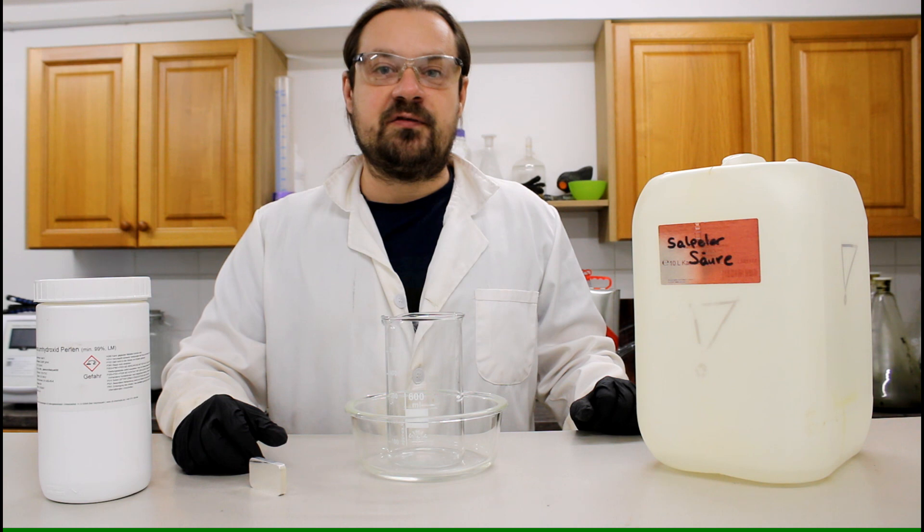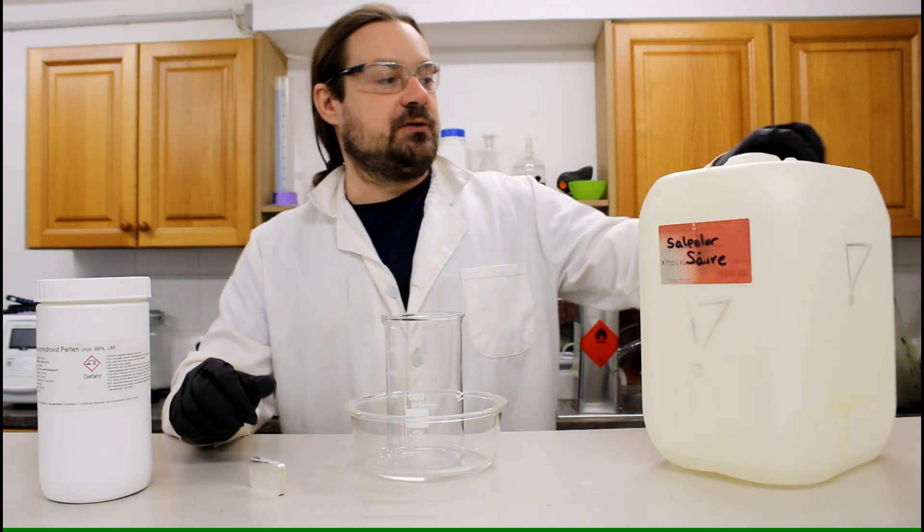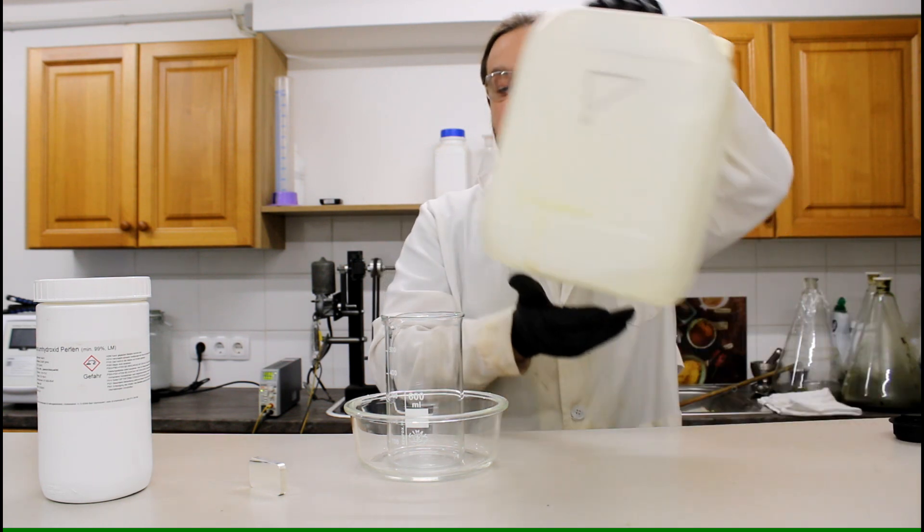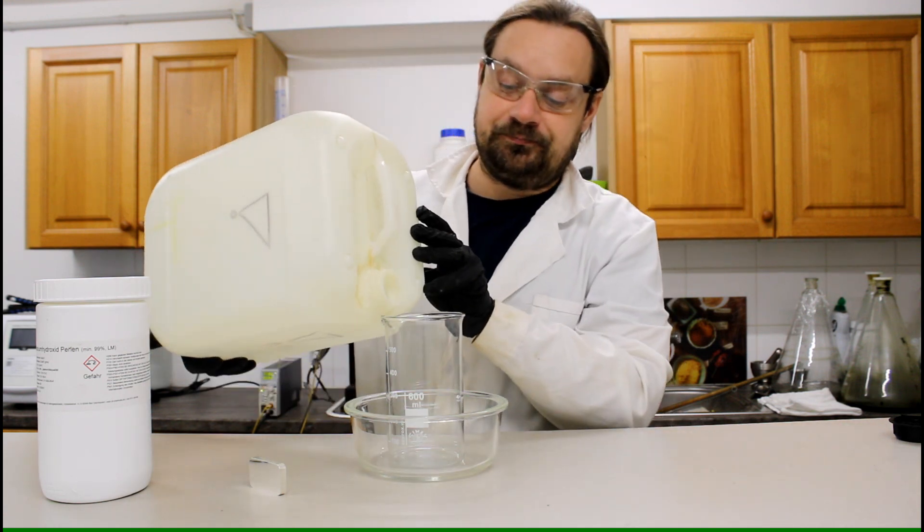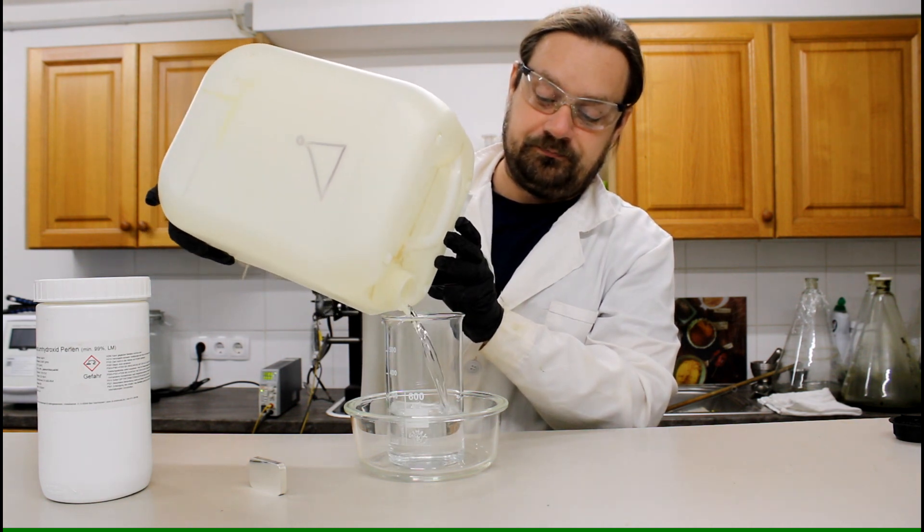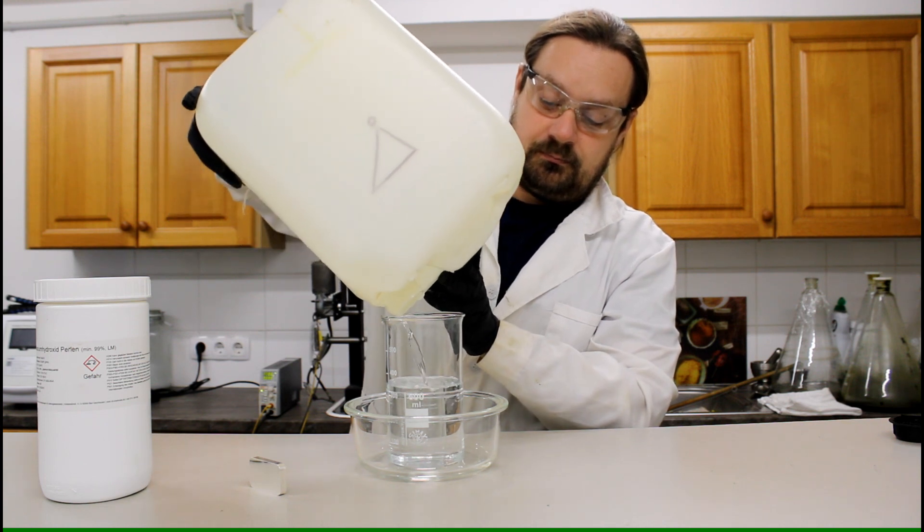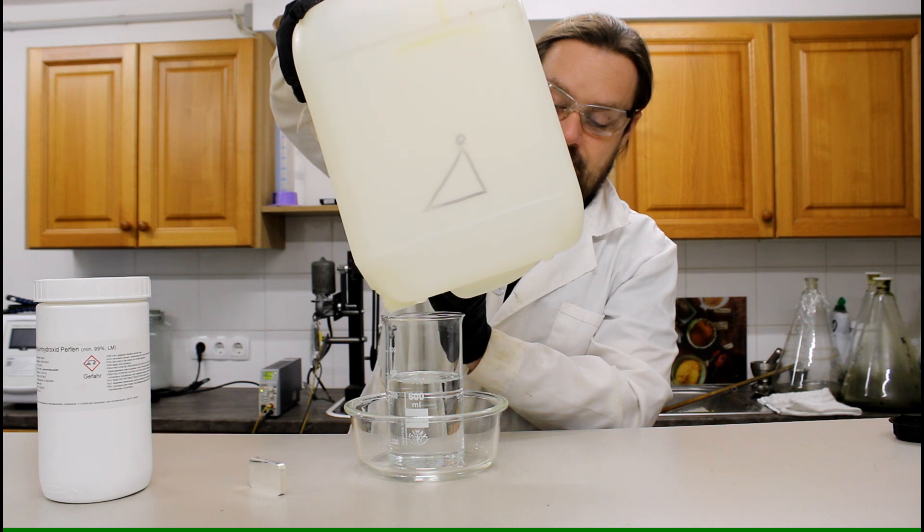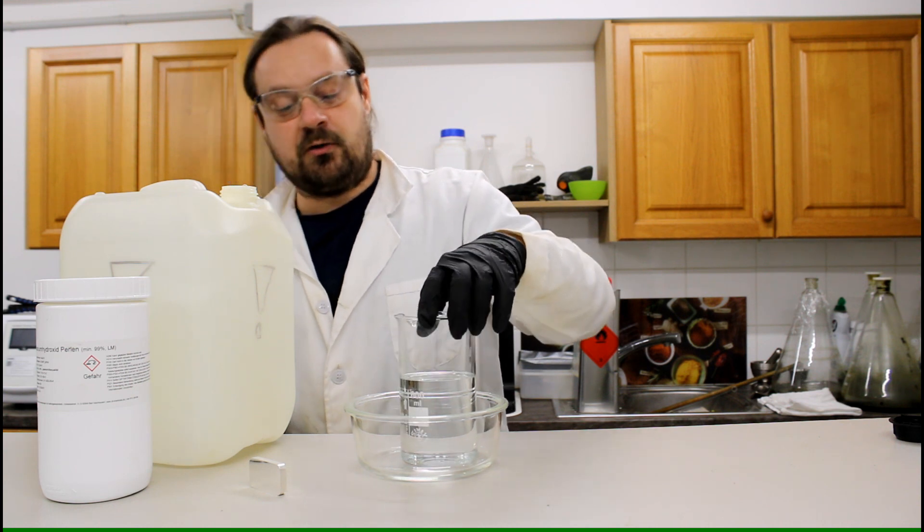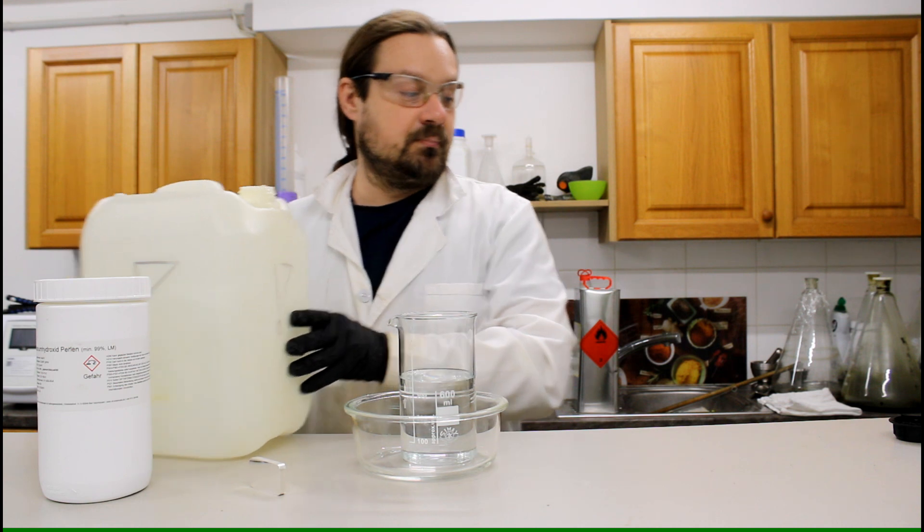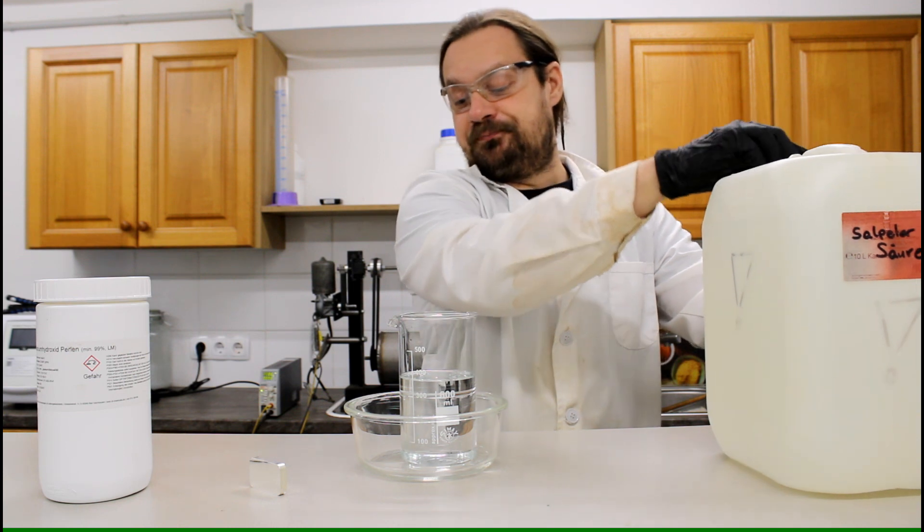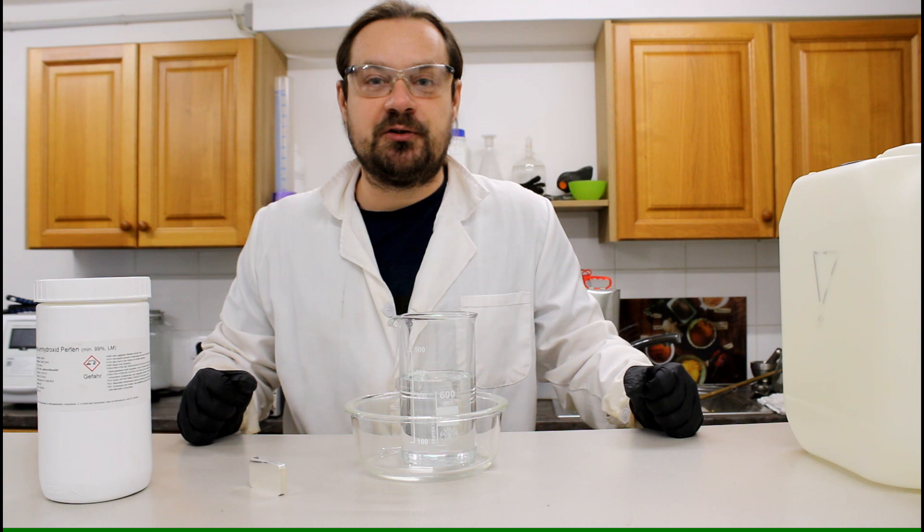It's important to work in a fume hood so I'm just going to pour out the nitric acid in the beaker and then we are going to the fume hood to dissolve the silver. Let's see how much we have left. Okay, almost 400 milliliters. Let's see if it's sufficient to dissolve 100 grams of silver. Okay, let's go to the fume hood.